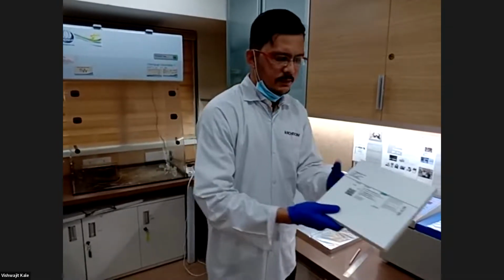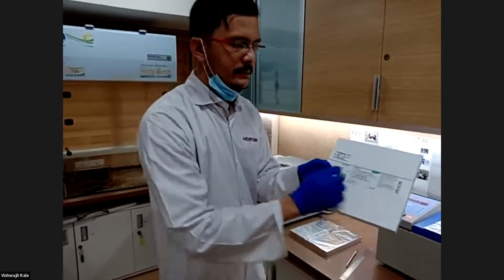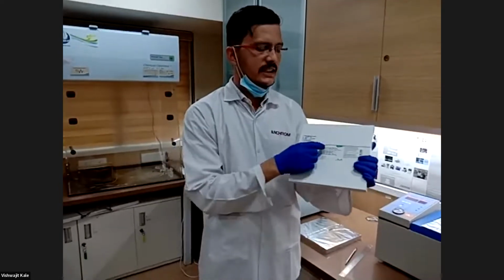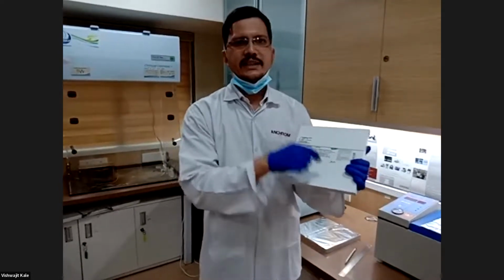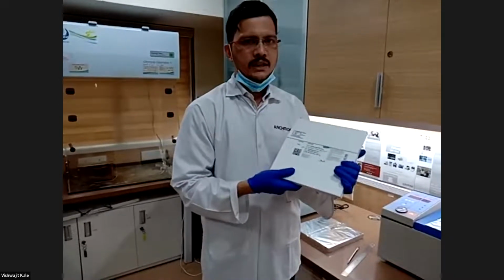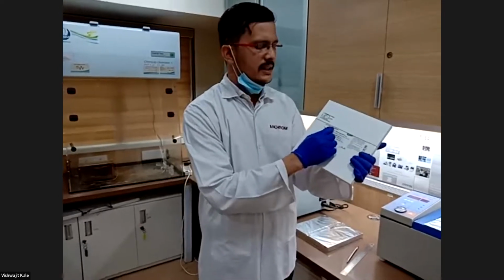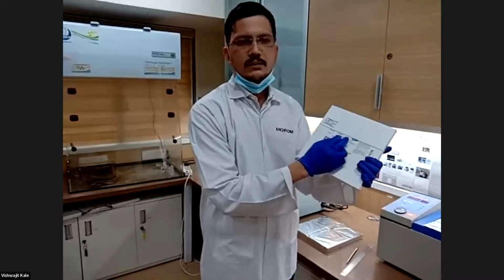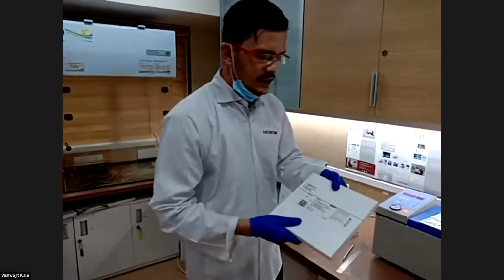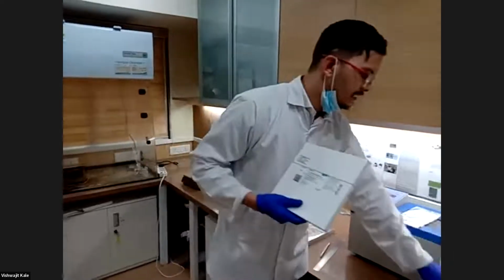So this is the plate box. Here they have written TLC silica gel 60F254. So these are normal phase TLC plates having 10 microns particle size, with an indicator added into the silica material while coating the plate. So these are pre-coated plates by Merck. We can design and order as per our requirement by catalog numbers by Merck. So this is 1.0555 for the TLC silica gel normal phase plate.